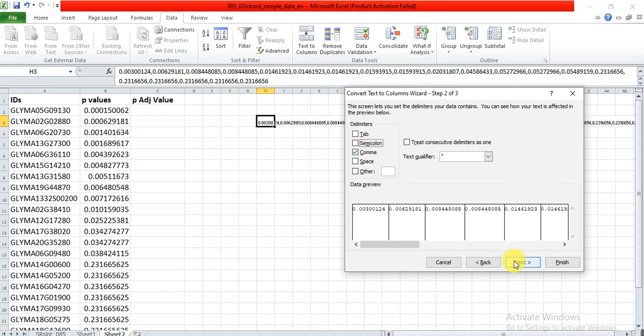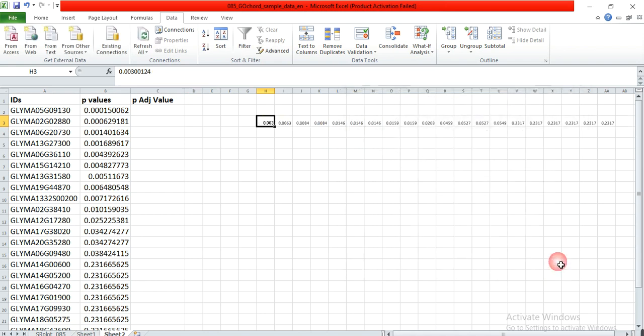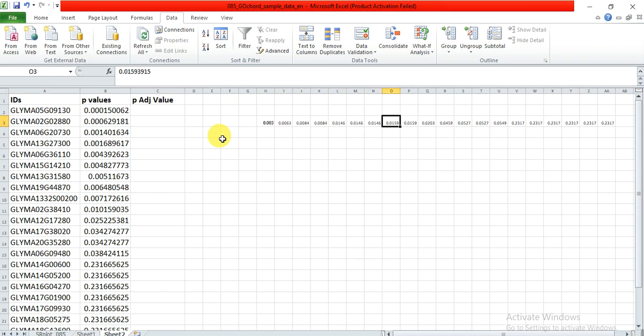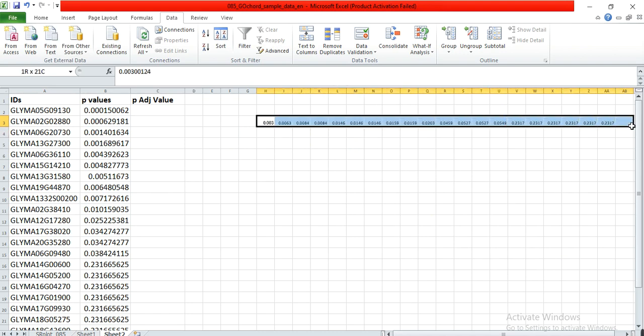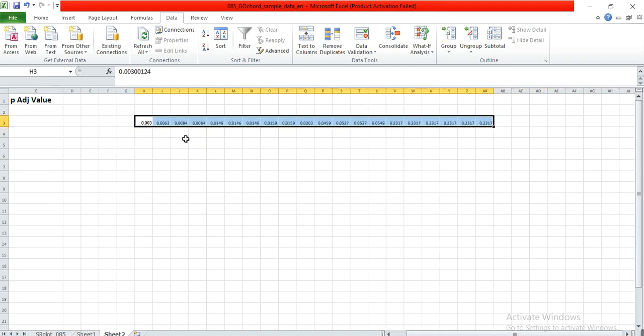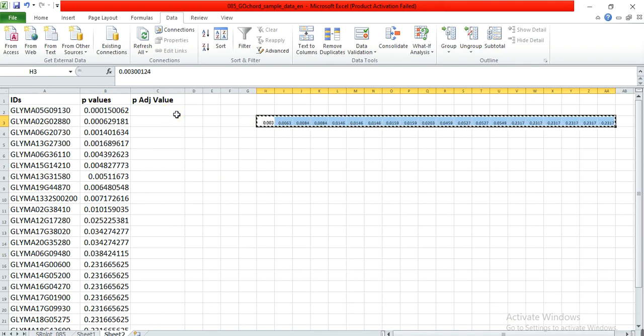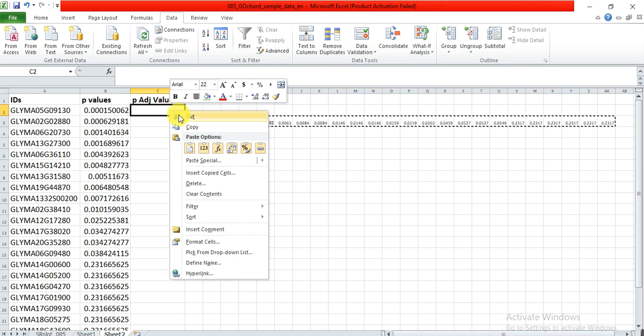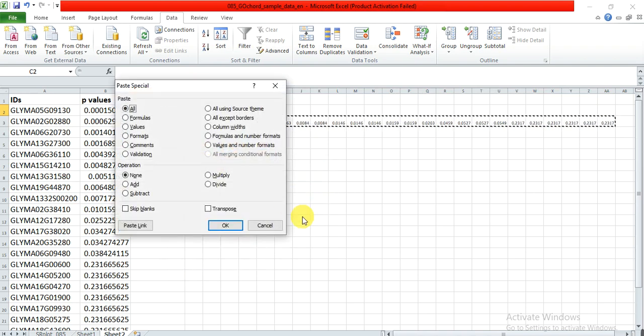Here we see there is a comma between two values, so we click on comma, then Next, and Finish. Now every value comes in a different cell. These are in one row but we need these values in our column.